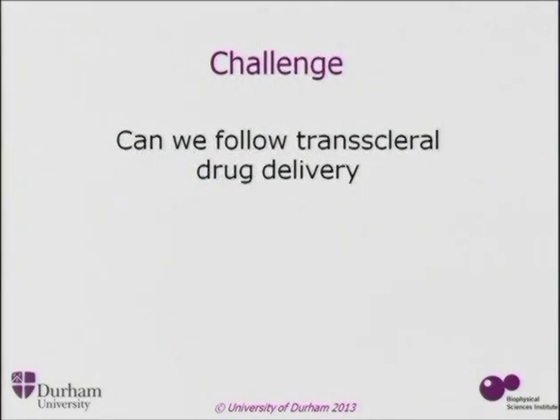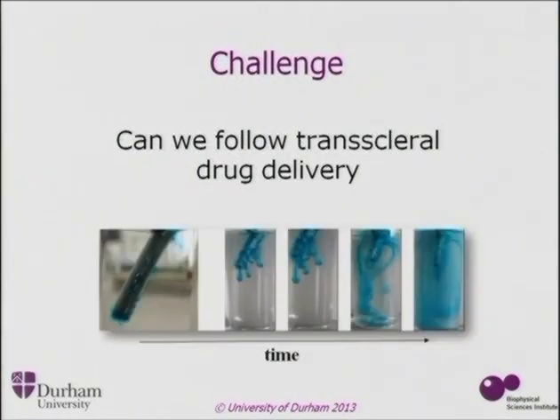So can we use this in something? So we built it up. So we were working with somebody who was very interested in doing slow and controlled drug release. In this case, this is a silicon rubber implant, and this is clearly just a blue dye to demonstrate. But they want to put these, and in this case, they particularly wanted to do it for delivering drug through the white, through the sclera of the eye.